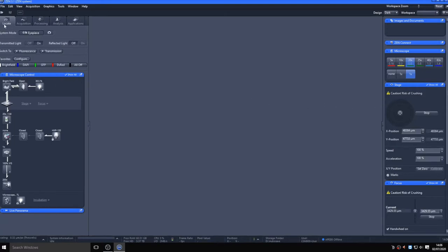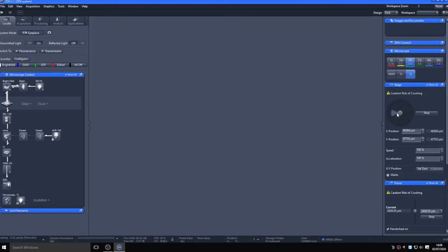Within the locate tab, you have access to an overview of the light path and pre-configured favorite tabs for brightfield imaging as well as fluorescence using DAPI, GFP, and DSRED filter cubes, and finally a control that switches off all of the lamps. On the right-hand side you have controls for changing lenses, controlling the microscope with the virtual joystick, and focus control with a virtual focus slider.